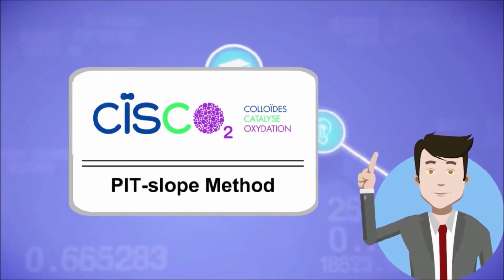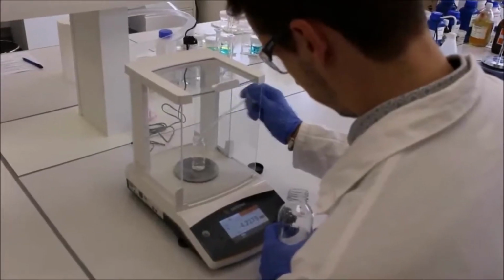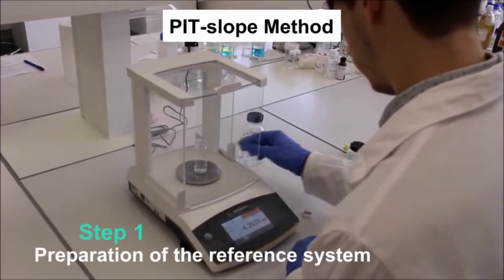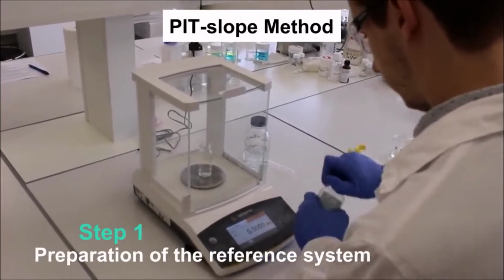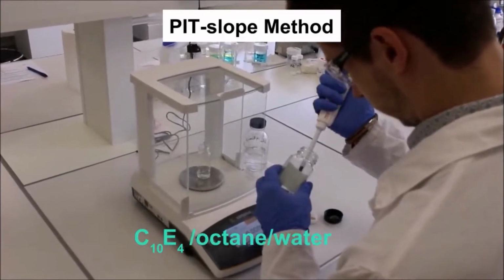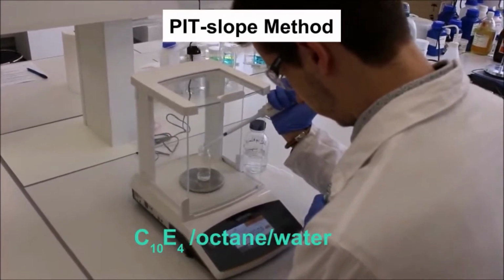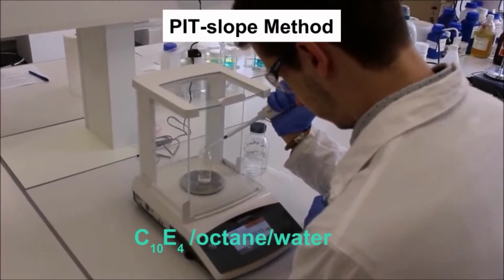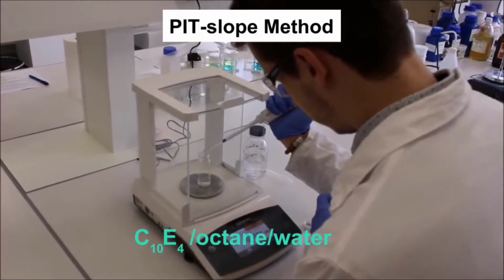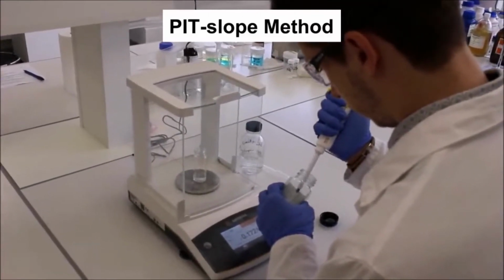How do we proceed experimentally to determine the PIT slope? Step 1: preparation of the reference system. The reference system is C10E4, n-octane, and an aqueous solution of sodium chloride. The C10E4 is a well-defined polyethoxylated surfactant. The weights of the oil and water are the same, in order to privilege the behavior of the surfactant in the morphology of the emulsion and not the quantity of one of the two immiscible phases.